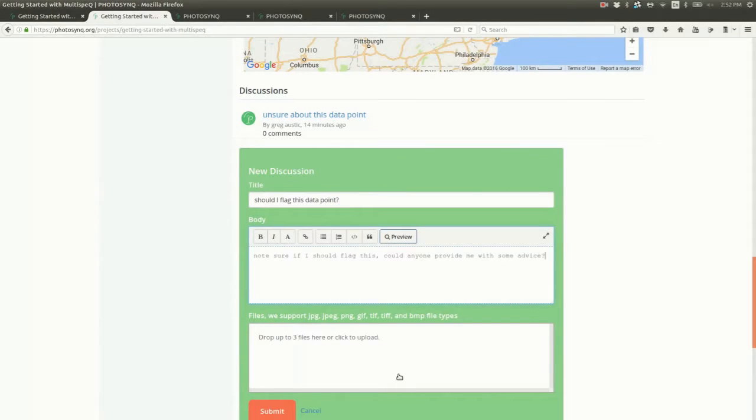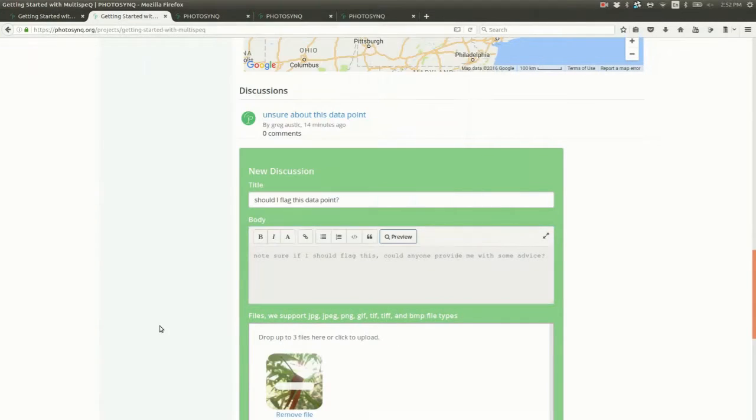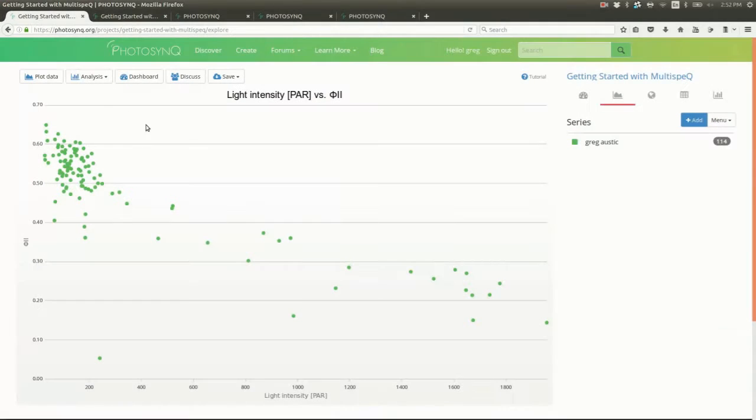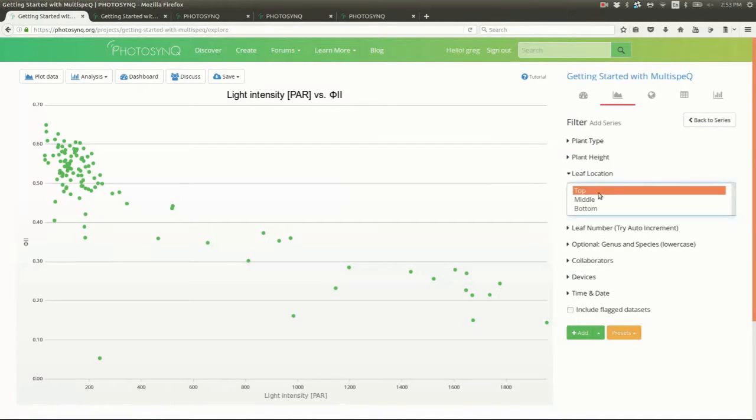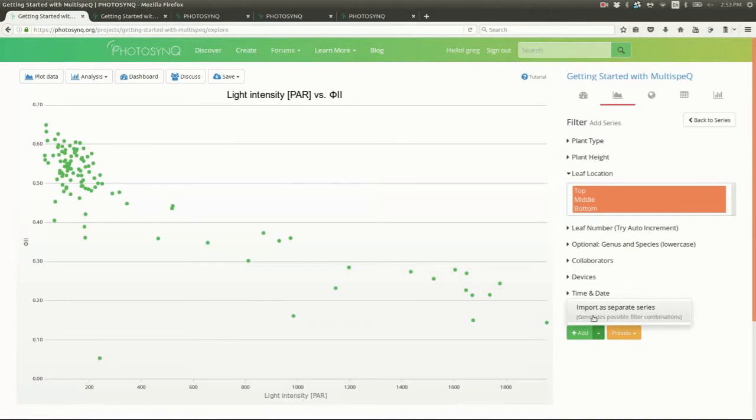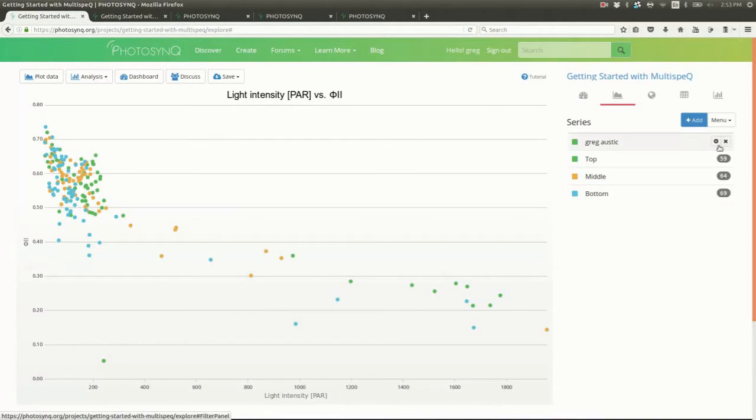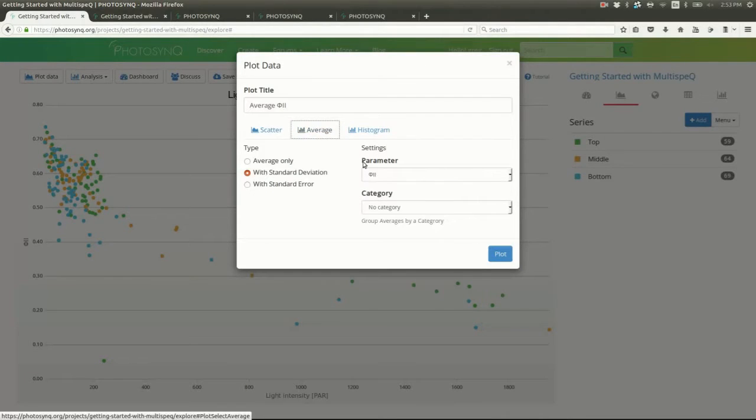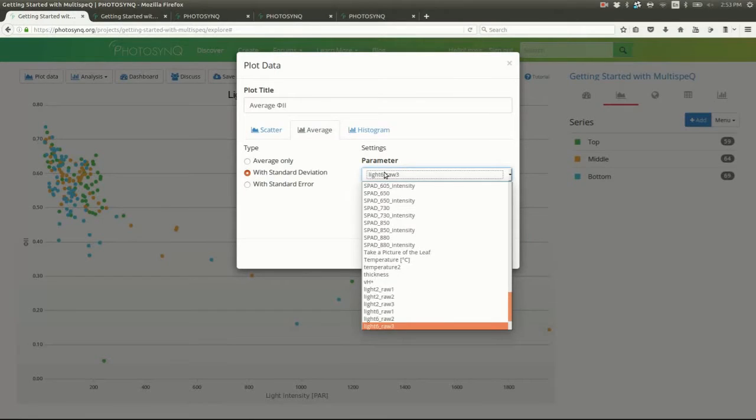Now let's compare the different leaf locations: top, middle, and bottom. Go add a new series for top, middle, and bottom, and delete our current series. You can select several answers and add them at the same time using the Import a Separate Series option. Now go to Plot Data, and let's compare averages for these groups.